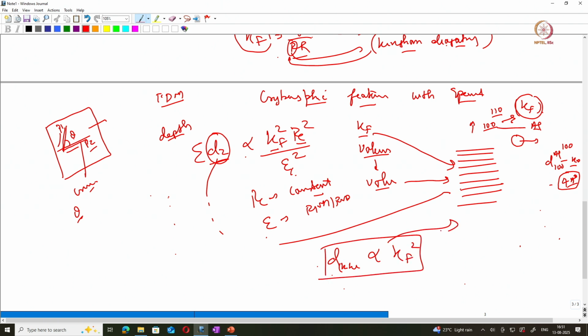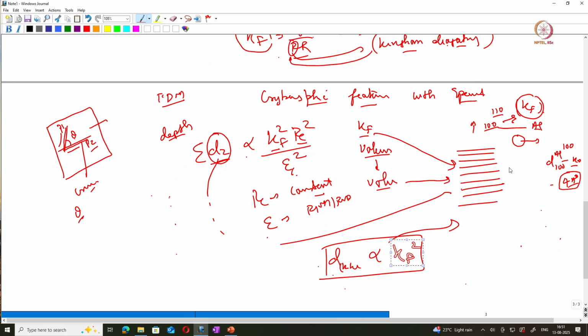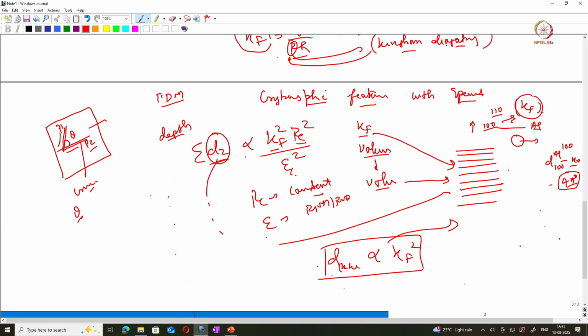So with this, we can determine the kf value accurately based on the reconstruction. Okay, so we can fine tune the value of kf such that your atomic planes distance comes to a value equal to the d spacing of the 100 plane of aluminium. With this we can also use multiple poles for calibration, so that you can accurately determine the kf value.